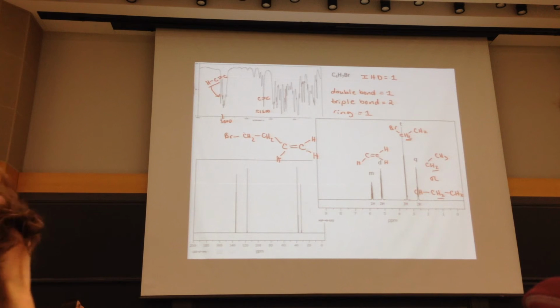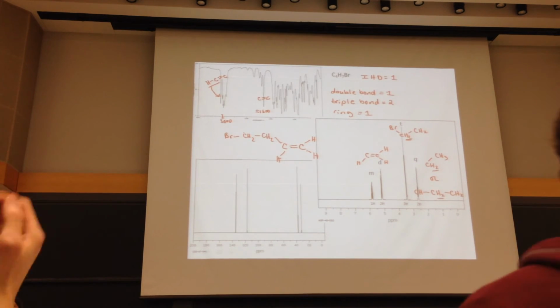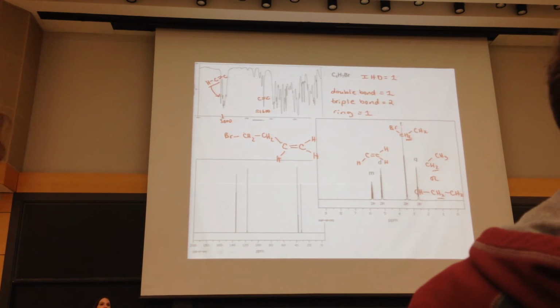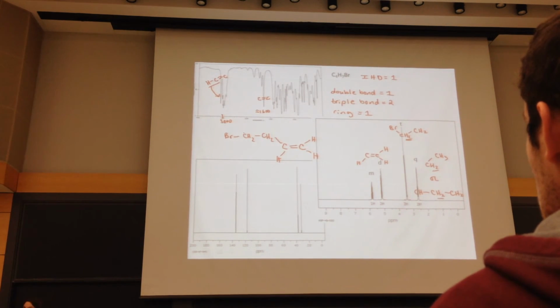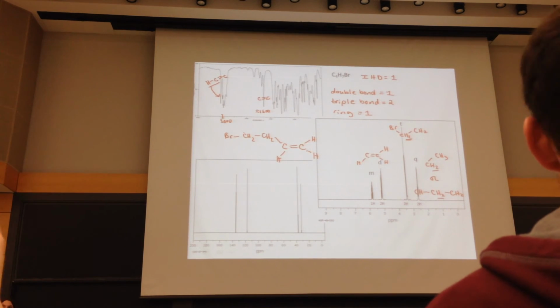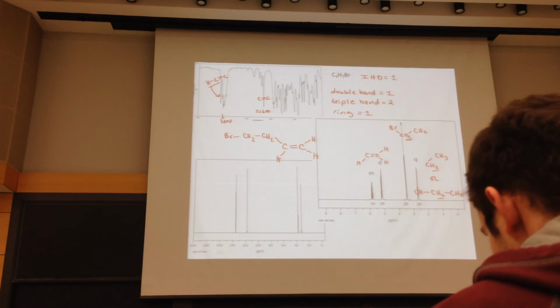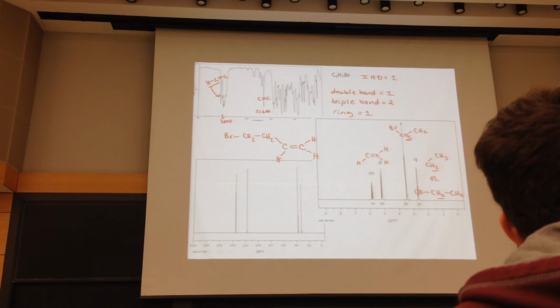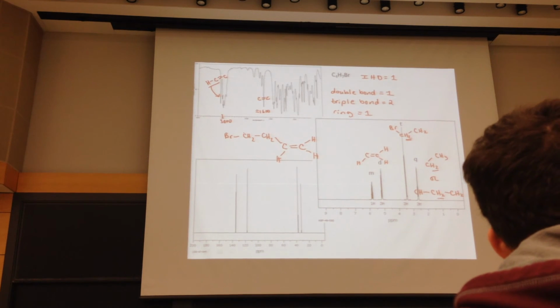Again, we were able to solve the problem without ever looking at the carbon. Quite often we can. You can verify that we do have functional groups initially, but we do want to go back and assign our peaks. Yes. Make sure, even if you don't need it, make sure you do go back. That's going to be part of the points. With the carbon-13, we didn't look at it as much. The table that you have isn't truly a table, it's just that diagram with the broad ranges. You may not necessarily be able to identify which carbon exactly is which. In some of the cases, if they're ambiguous, and you get them backwards, it's no big deal, you're still going to get the points.